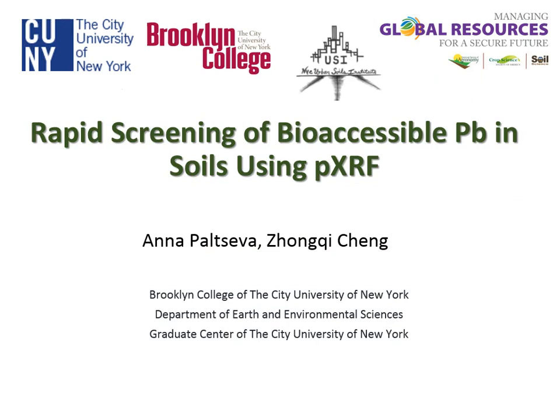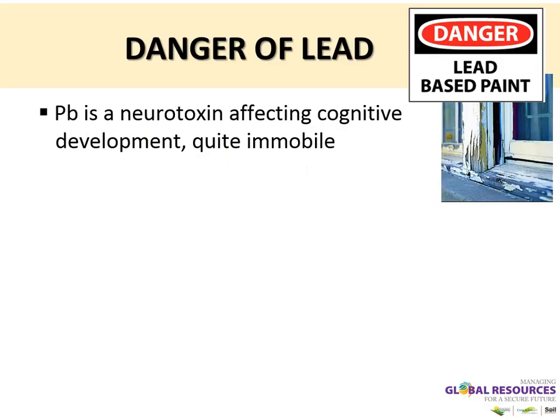So this is the new method that we propose to screen for bioaccessible lead in urban soils, and this is still ongoing research, so we welcome your comments, critiques and further suggestions. This research is being done at Brooklyn College in New York, City University of New York, but we also collaborate with Columbia University, who had this original idea, and Francisca is here also. So hopefully we will collaborate together on this and publish the paper, and you will see next time the whole data set together. So why are we doing it?